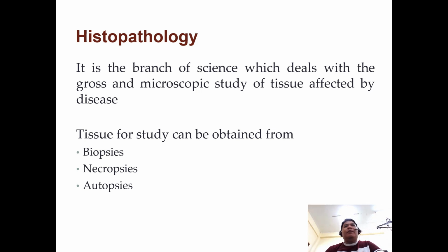In histopath, we use histopathology in order to examine the microscopic lesions, specifically lesions from tissues caused by infectious or non-infectious diseases.